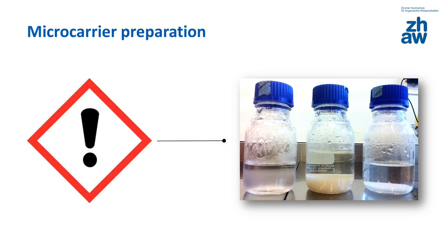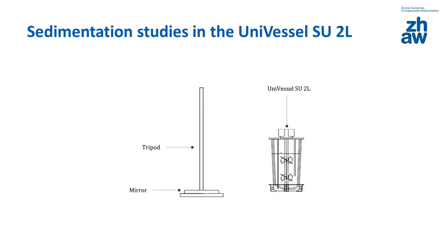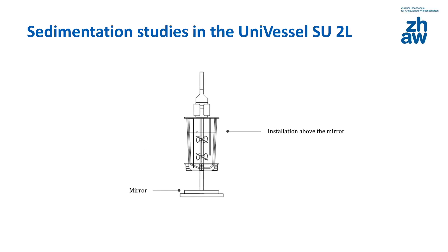Firstly, the microcarriers are prepared and equilibrated according to the manufacturer's instructions. For all the suspension studies, it is important to have optical accessibility to the bottom of the bioreactor. This allows the suspension characteristics of the microcarriers to be assessed. For this purpose, the Univessel SU2L is fitted with a mirror which guarantees a clear view of the bioreactor bottom.